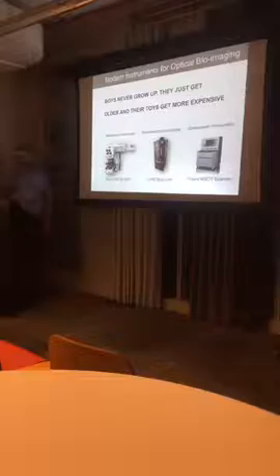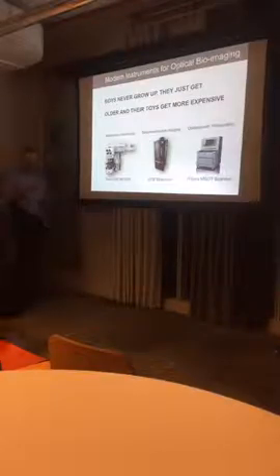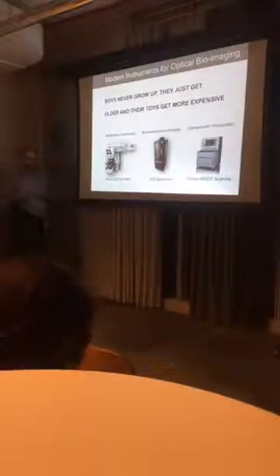What level of resolution do you get? Okay, good question. When we mention resolution, of course, we cannot compete with electron microscopy. When I planned this lecture, I didn't want to go into the resolution issue because a lot of time could be spent. But let's say this microscope can go up to the diffraction limit resolution in the spatial XY, and about half a micron in Z resolution.